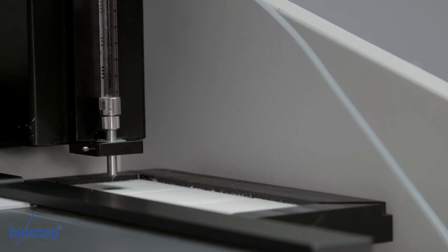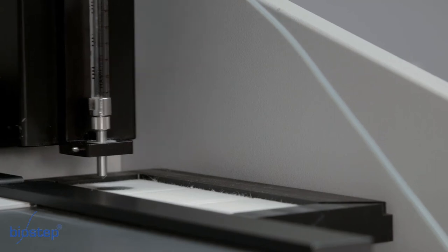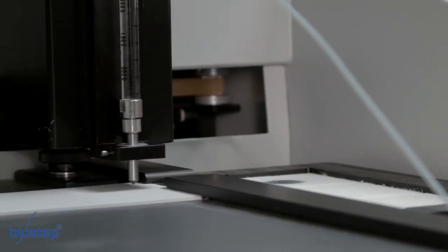Some microliters of the sample are ejected on the filter paper. After a short interval, the dosing syringe moves to the starting position above the TLC plate. The sample will be applied according to the instructions of the chosen program.